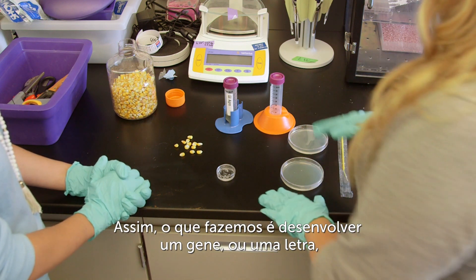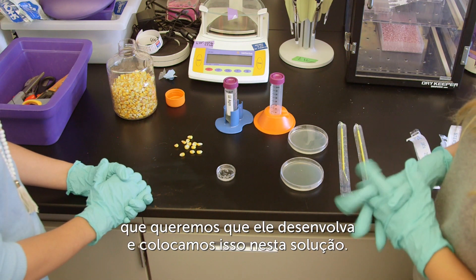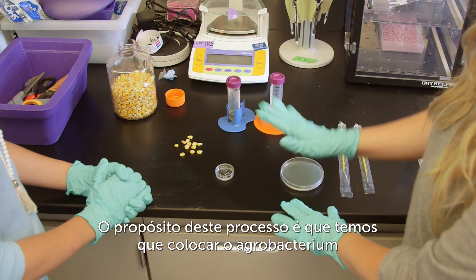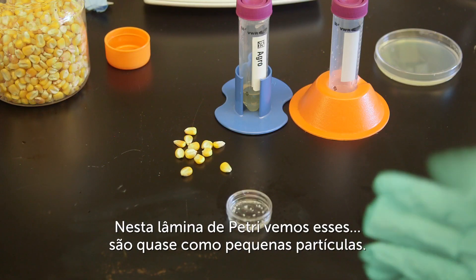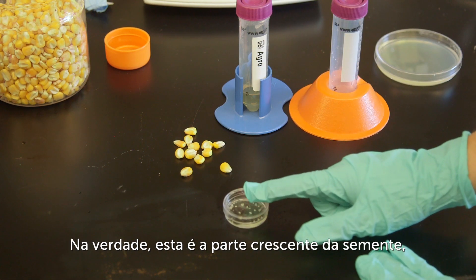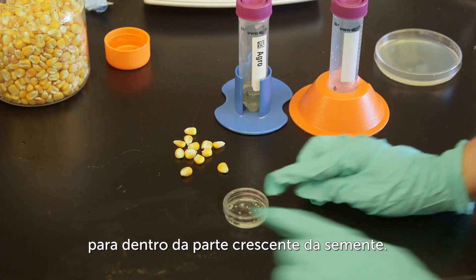So what we do is we develop a gene, or a letter, that we want it to deliver, and then we put it into this solution. The whole point of this process is that we have to get agrobacterium near the plant to put the new gene in. Here you can see this little petri dish full of these — they almost look like little specks. This is actually the growing part of a seed, and we want to direct our new letter, or our new gene, into that growing part of the seed.